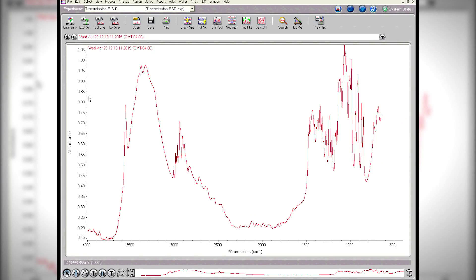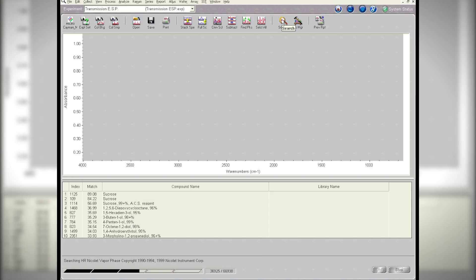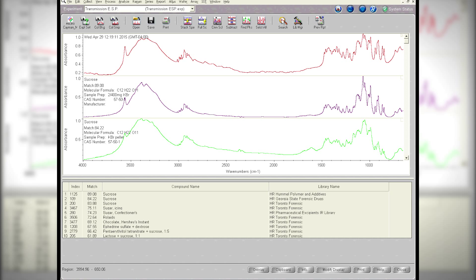So there's my spectrum of the material. Let's do a quick search to see if we can identify what the material is, and very quickly it pops up with sucrose as the top hit. This is sugar, which is how we made the sample — we ground it up together. For diffuse reflectance, the important things to remember are: don't overload the sample, make sure the top is nicely smoothed off, and that the sample is ground well. In that case you get good signals, as we can see here. So that is the diffuse reflectance experiment.